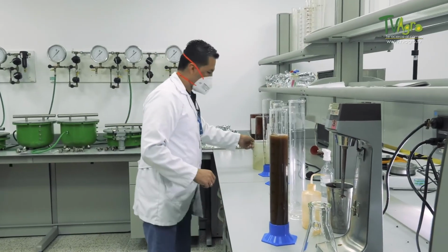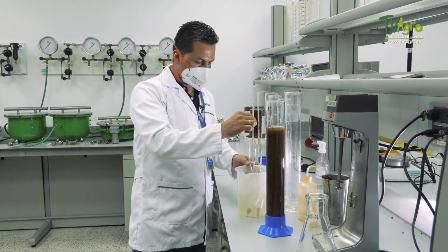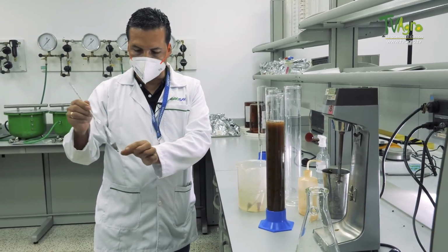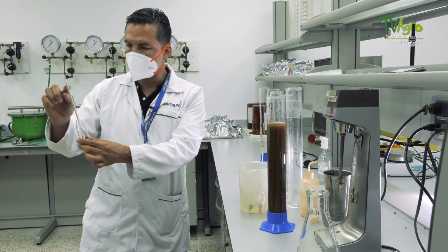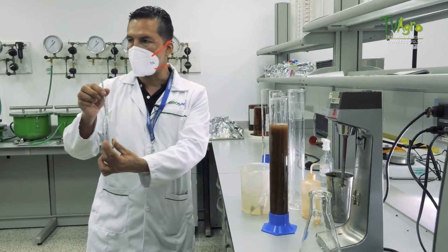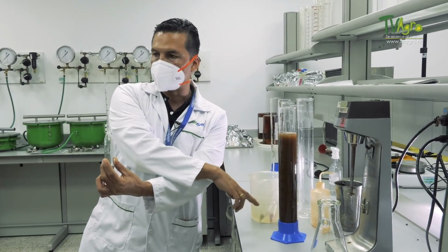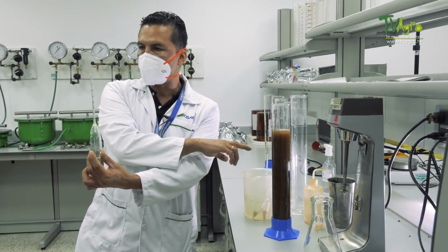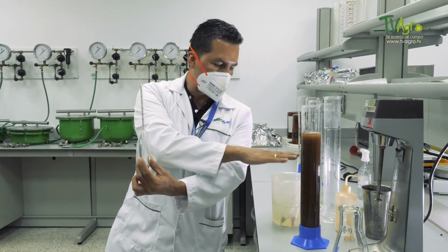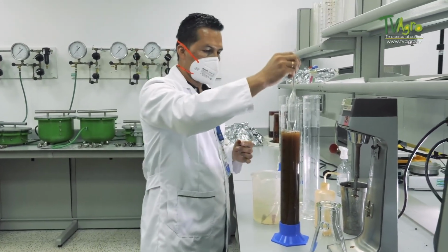The total volume is 1 liter of water, and once the volume is completed, then we have a hydrometer, which is a measuring device that has a lead at the tip and a scale, right? It will give us the density of the water as all the components of the soil are decanted. The soil is composed of silts, clays, sands, and then, as they decant, the density of the water changes, and this will indicate its texture.